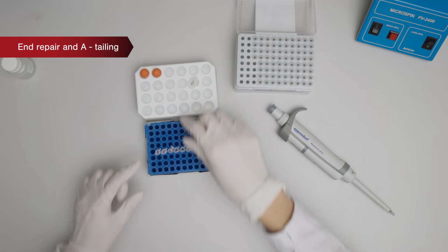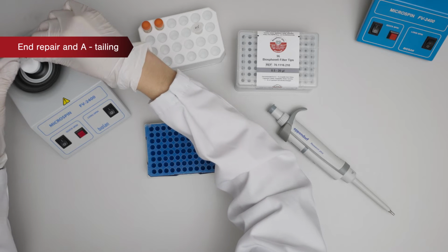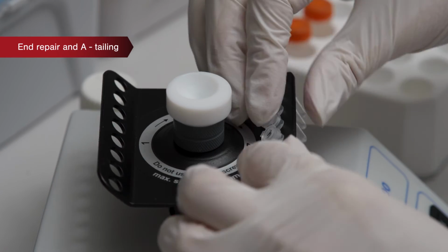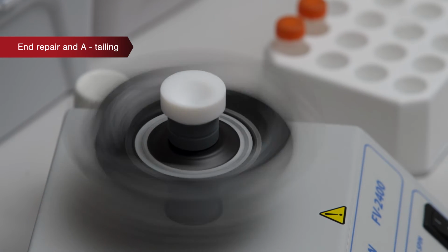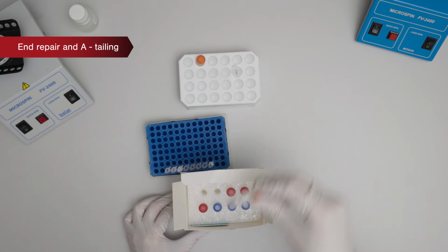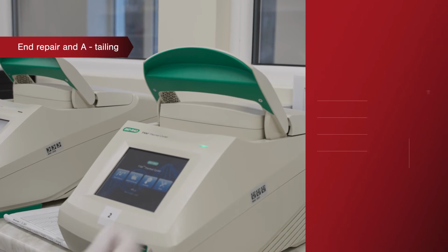After adding the ERAT mix, samples are vortexed 3 times for 3 seconds each time, centrifuged and incubated according to the protocol. Samples are placed in the thermal cycler in the following conditions.